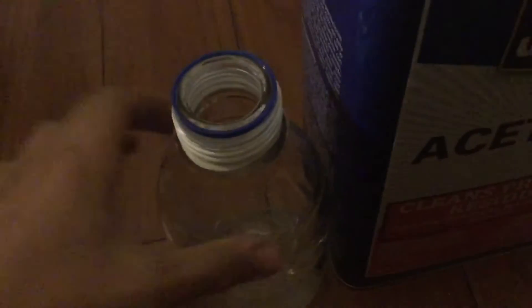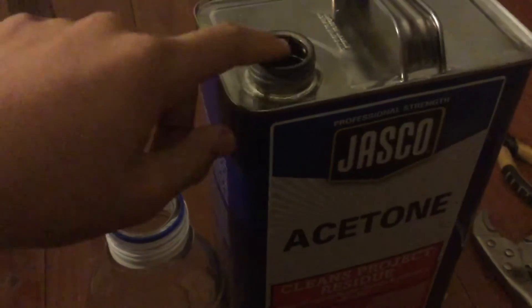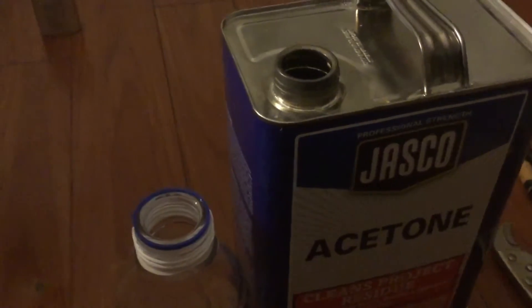I need to stock up my acetone bottle again and I bought this new can of acetone. These are very annoying because if you try to pour it, it just dribbles everywhere. So here's the idea I came up with.